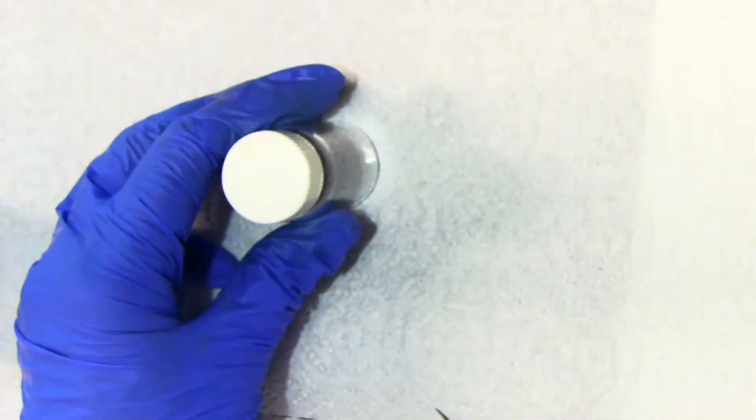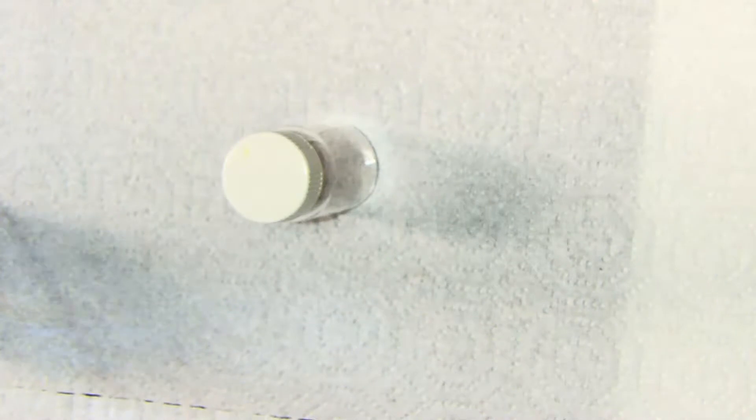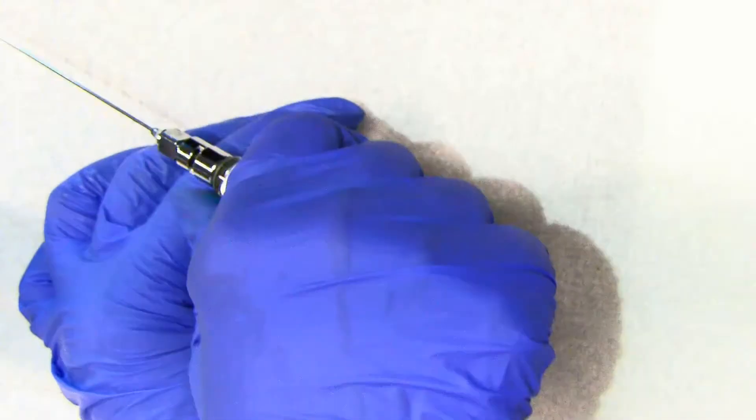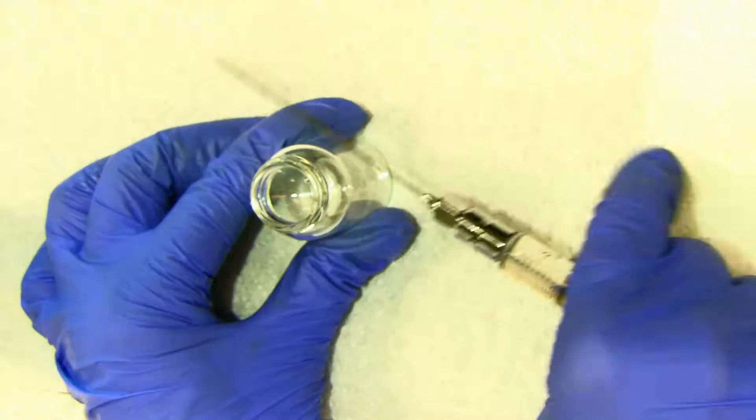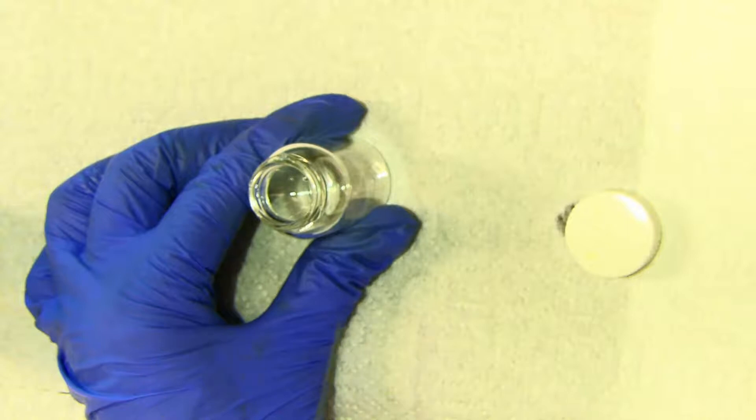Now what I do once I have the liquid in my syringe is deliver it into the oven-dried capped vial that was dried for you before the beginning of the lab.